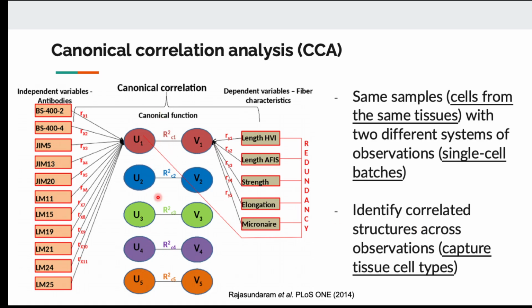So in this case, we want to identify the correlation between the two batches that explains the same cell type composition. And if we can do this, that means we have a way of mapping data from one batch to data from another batch. Because CCA essentially is mapping one measurement system to another measurement system to link the two together. In this case, we think of the batches as a measurement. So we want to correlate them together, we want to link them together.